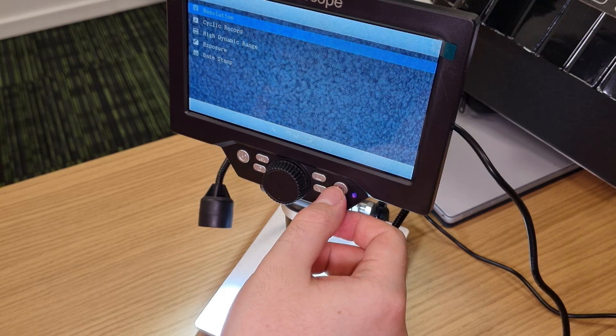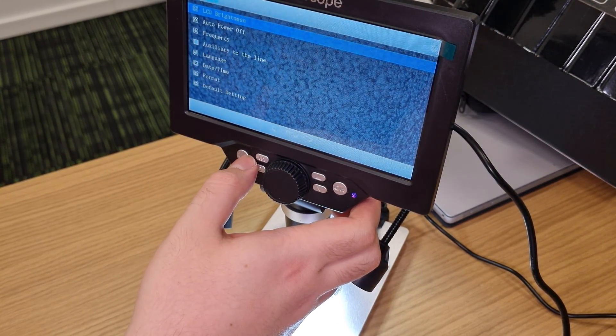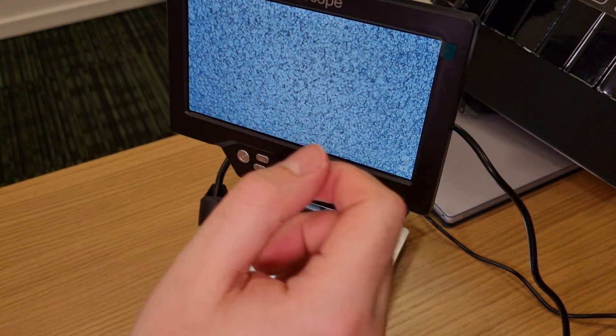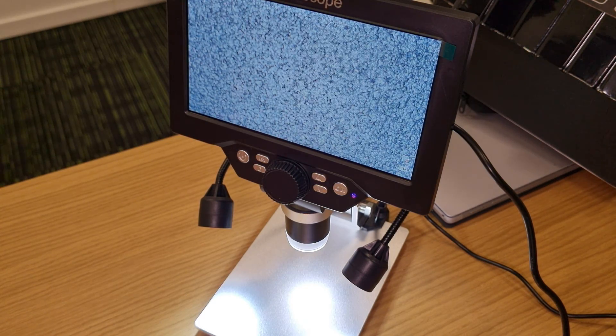What's interesting is that it looks like we can record video using this, which is a nice feature. There's a camera and SD card slot, so those are useful extras.